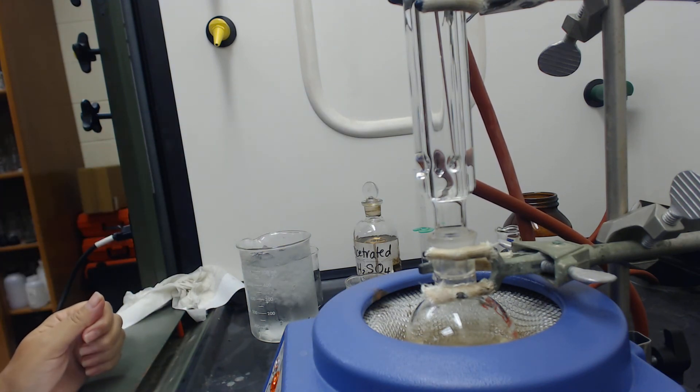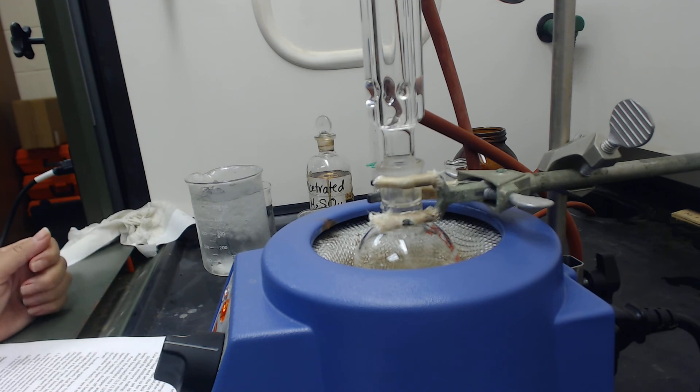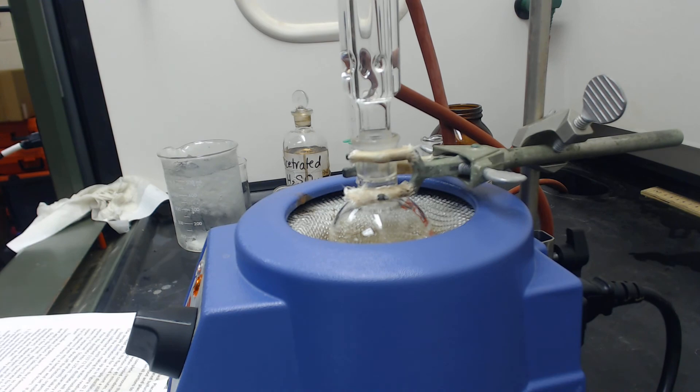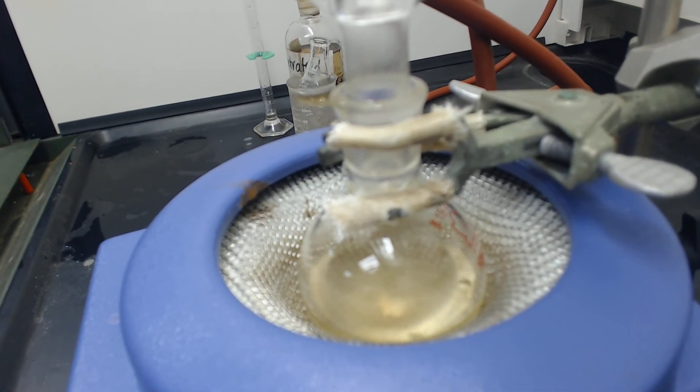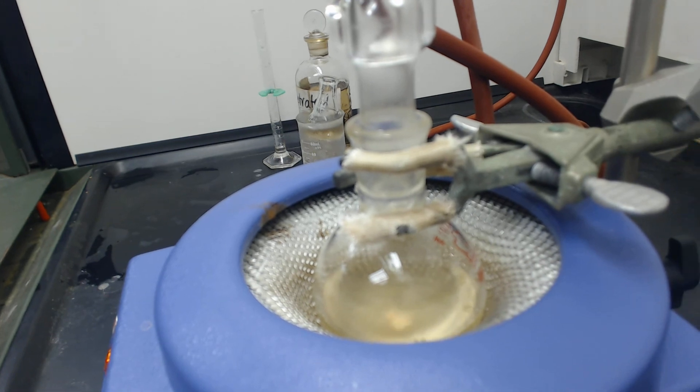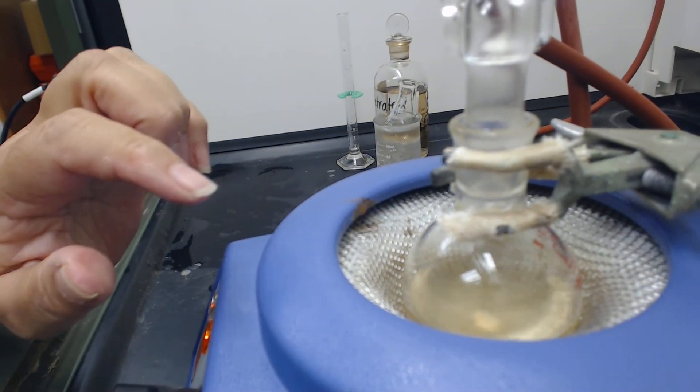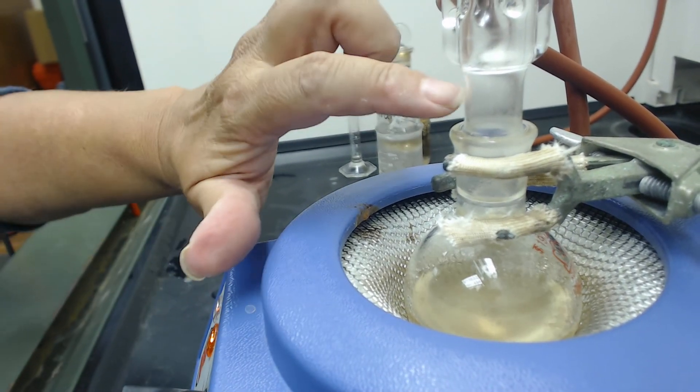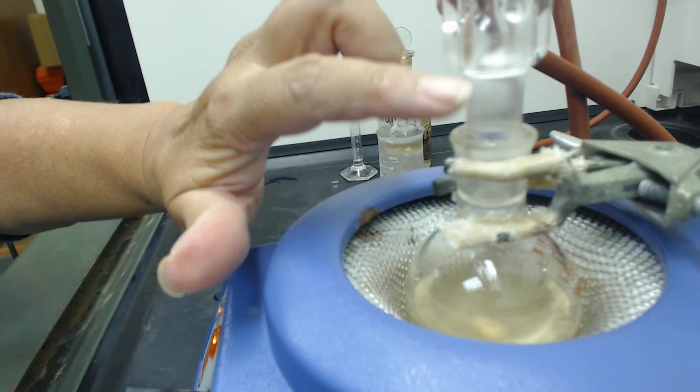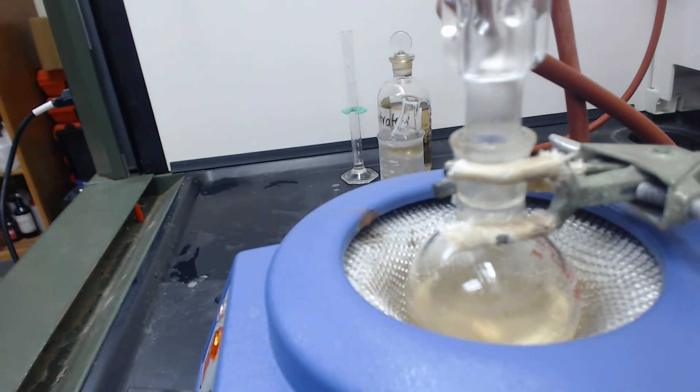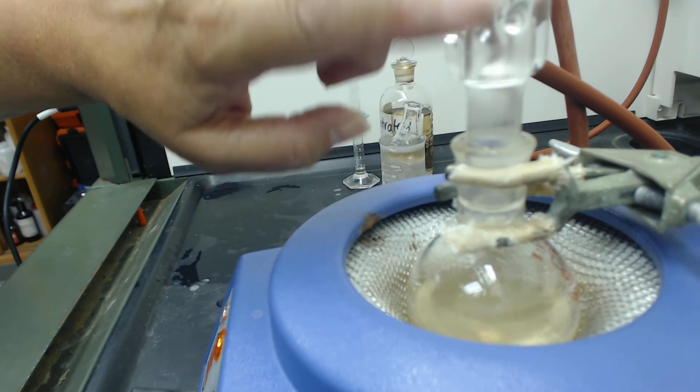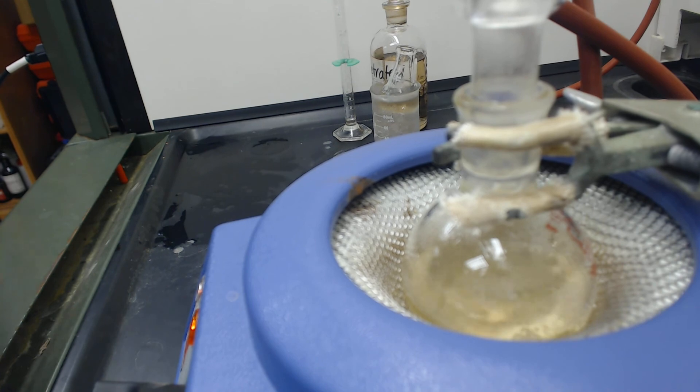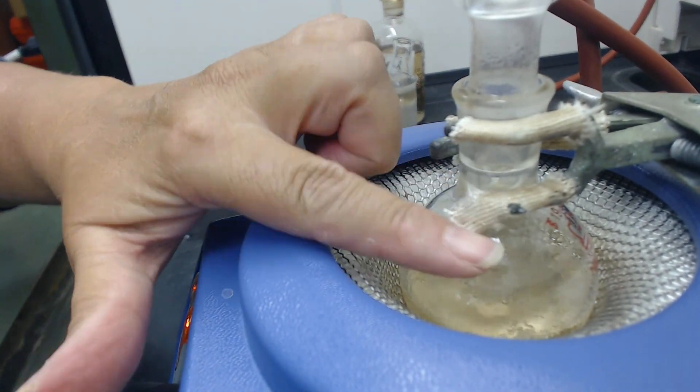All right, so it's starting to boil. You can start to see the vapors coming up here, but it's not escaping because it's condensing back down. I don't know if you can see it very well, but it's boiling and then it's dripping back into the flask right here.